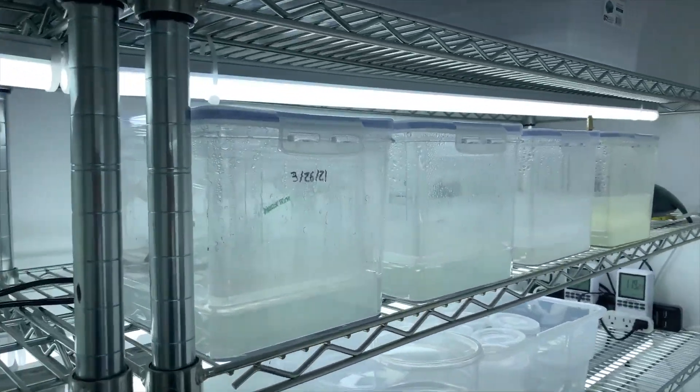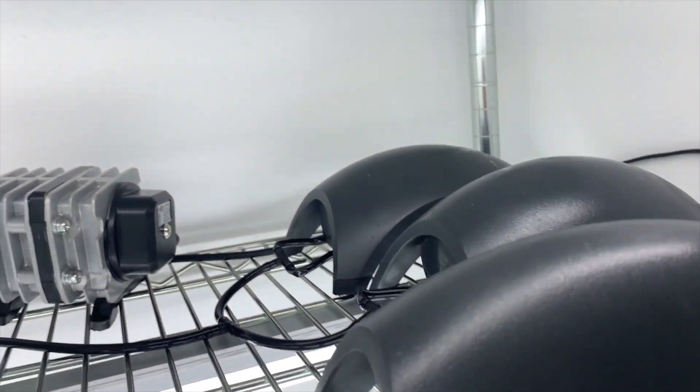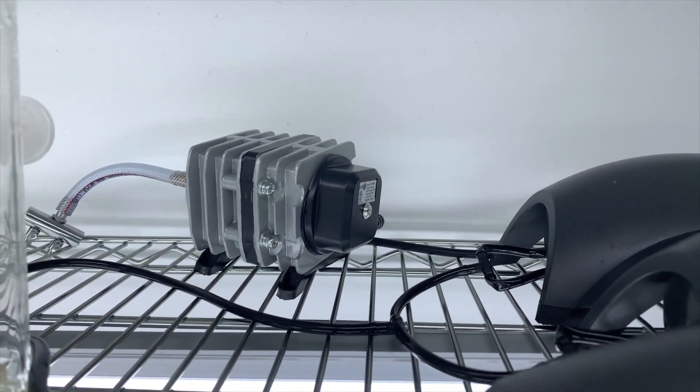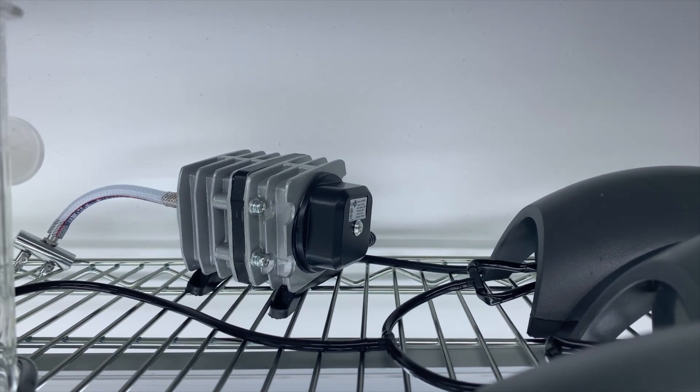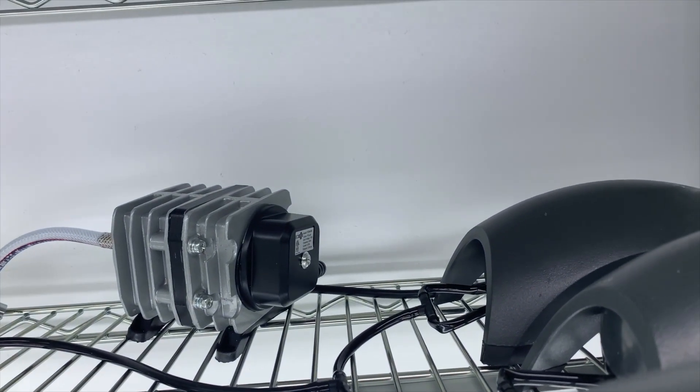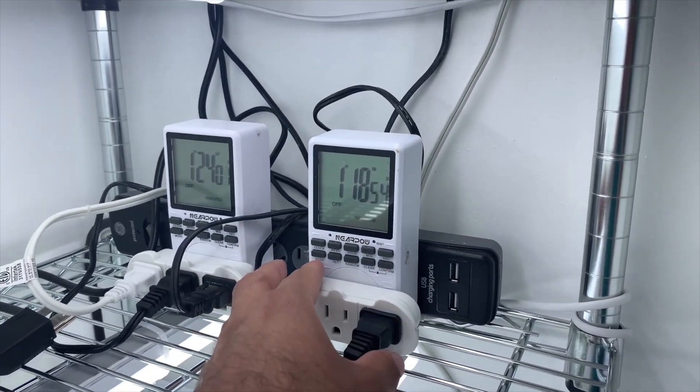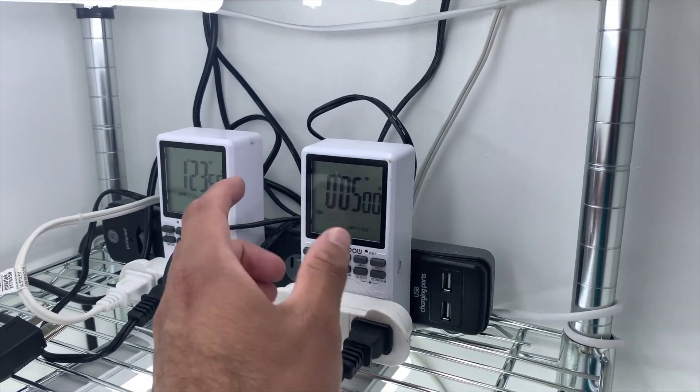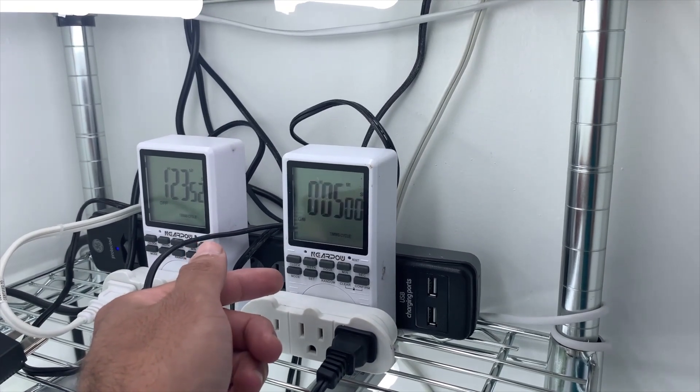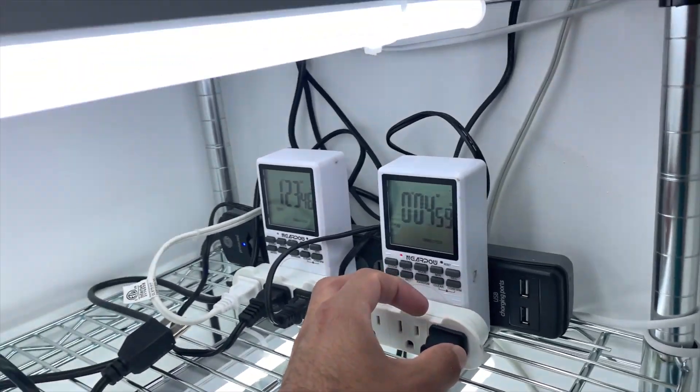Let me explain how the temporary immersion bioreactors work. They use three aquarium pumps, ignore that one over there, that is going to be for the new temporary immersion bioreactors, the homemade version. They use a solenoid and two timers. So the way it works is let me set up the timer. I have it set for five minutes every six hours.